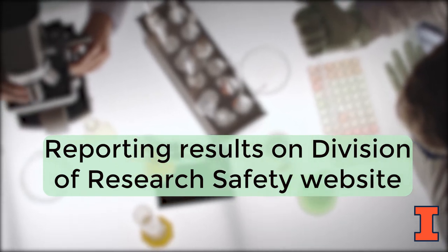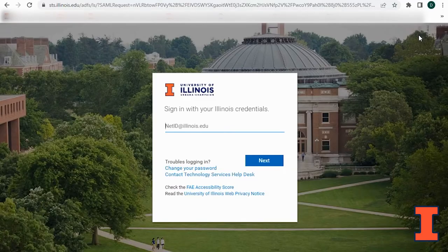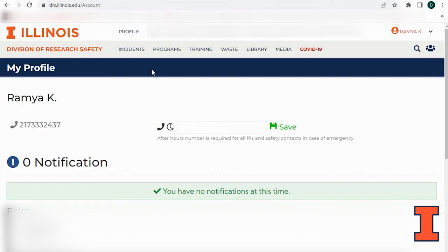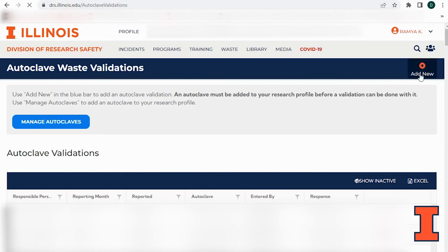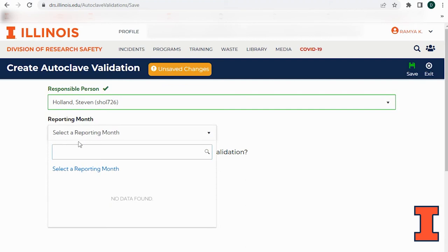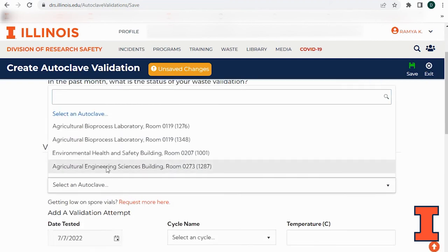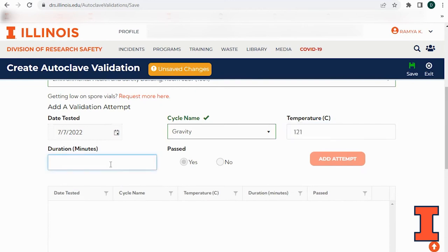Monthly validation results should be entered on the DRS website for each principal investigator or PI working at biosafety level 2 containment. To report results, log into the DRS website using your email address and password. Click on profile and select autoclave waste validation located under facility info. Use the add new button located in the blue bar in the upper right hand corner to enter a validation result. Select the responsible person or PI from the drop down menu. Then select the reporting month for the result being entered, followed by details on the current and past validation results. You may be prompted to give details on the autoclave used, date tested, cycle name, temperature, duration, and pass or fail. Click the add attempt button to enter your results. Save your validation results by hitting the save button in the upper right hand corner.